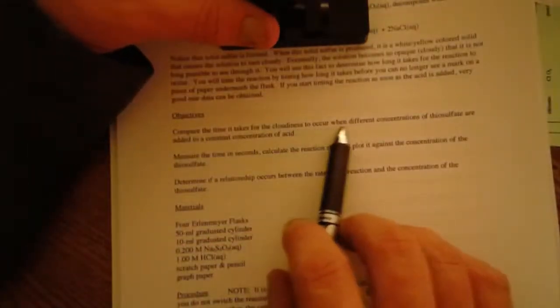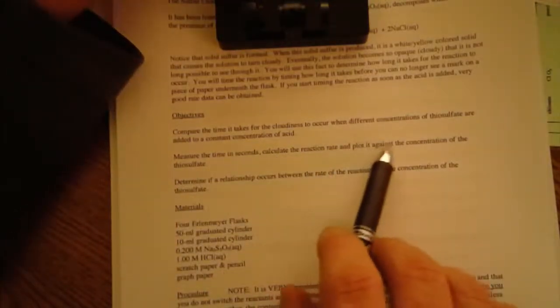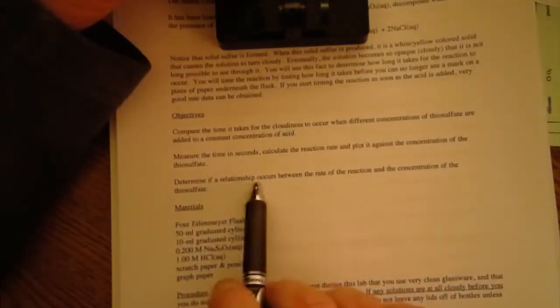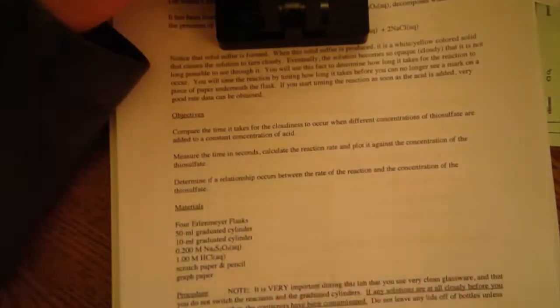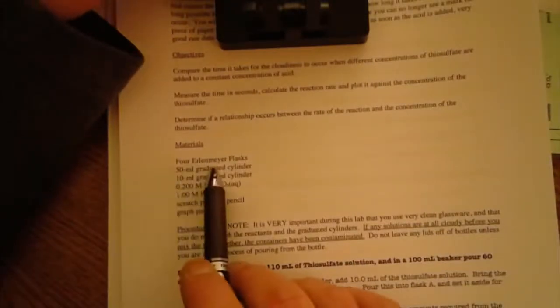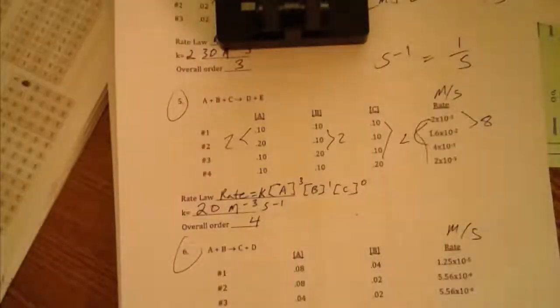So compare the time it takes for the cloudiness to occur when different concentrations of thiosulfate are added. Measure the time in seconds, calculate the reaction rate, and plot it against the concentration of thiosulfate. Determine what relationship occurs with the rate of reaction. Basically, we want to find the order of the thiosulfate for this. Here's what we'll be using. Erlenmeyer flasks. Have we used those yet? Let me grab those real quick.